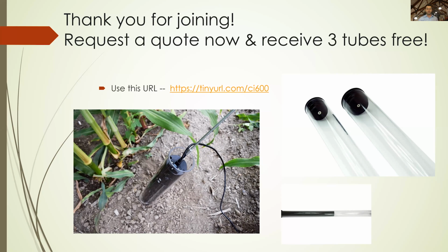The other thing I would suggest is because it is thinner, it does fit. There are a lot of 2-inch diameter tubes out there already from older technologies, and it does fit in those if you have them already established.